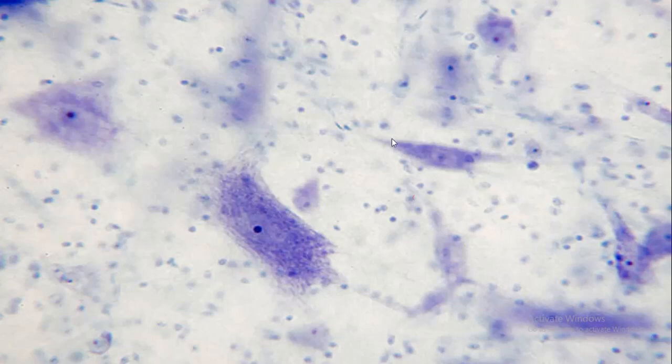In this slide, you can see this is the squamous epithelium. You can also talk about it having the nucleus there, and this has easily been appreciated. So this is the simple squamous epithelium, and in this practical you need to draw it using your pen and pencil. You draw it and you label it.